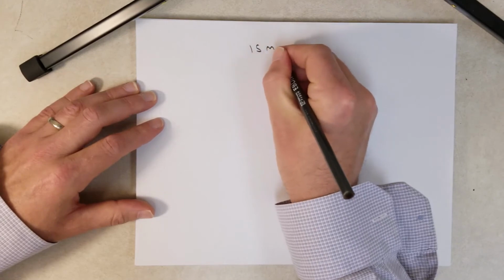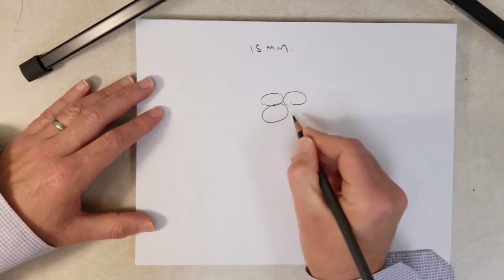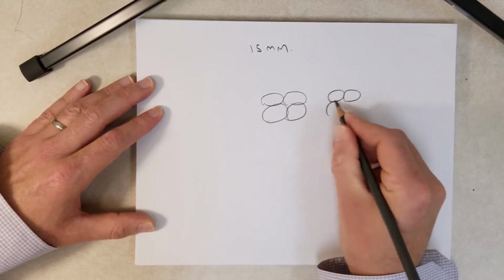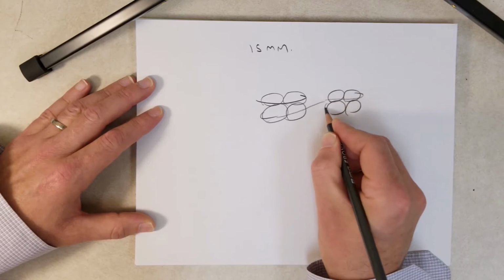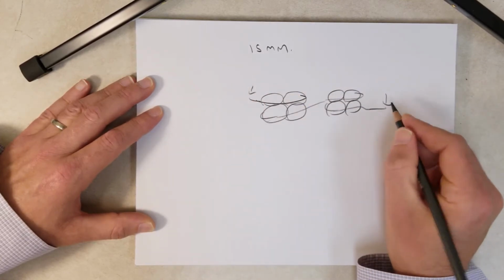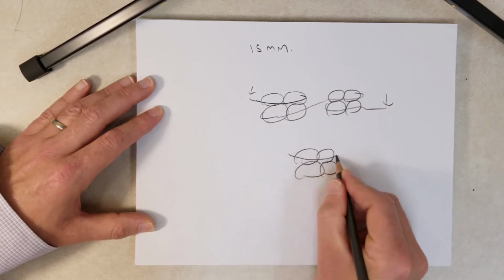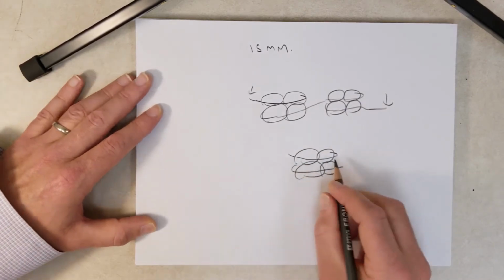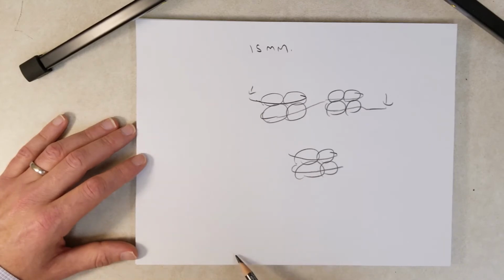How about after 15 minutes? Well, maybe after 15 minutes, we'd expect some of the 2 units, where micrococcal nuclease got here and here, but we probably expect a lot of the single units, just the single nucleosome units with the associated DNA that the micrococcal nuclease can't get to.